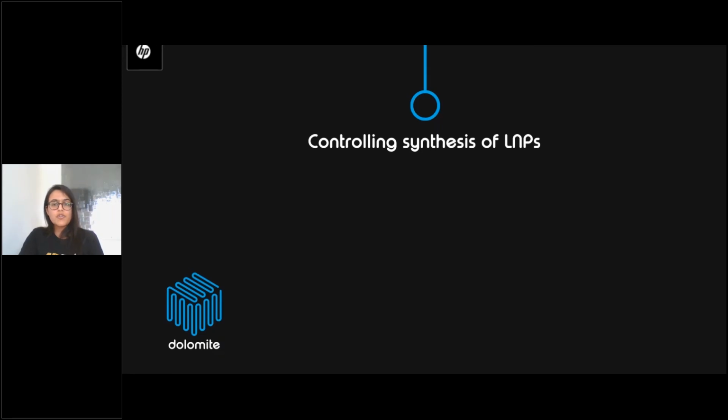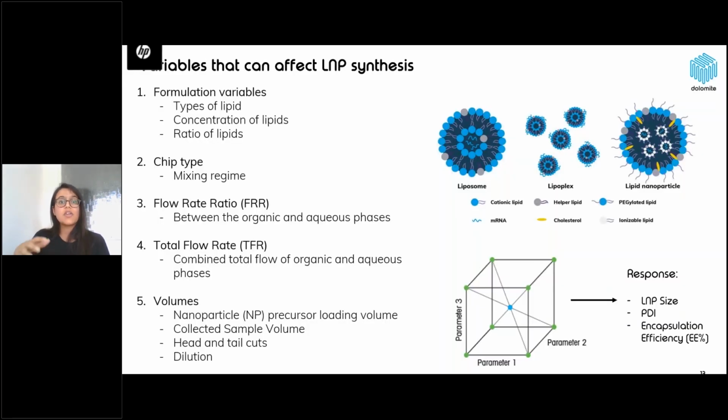So how do we control the synthesis of lipid nanoparticles? This doesn't stop at just some of the ones that I've stated here. There are various different variables that can affect the synthesis of your lipid nanoparticles.